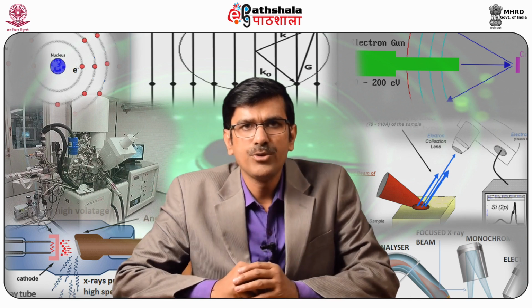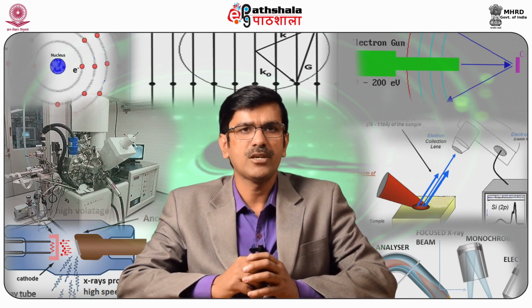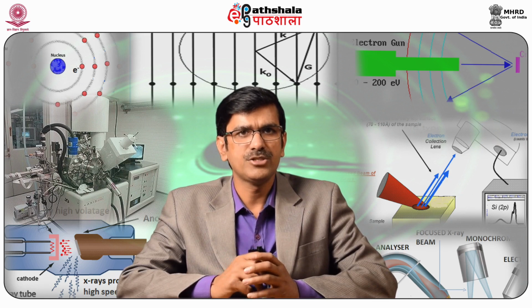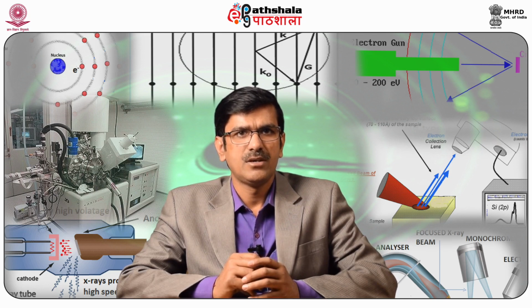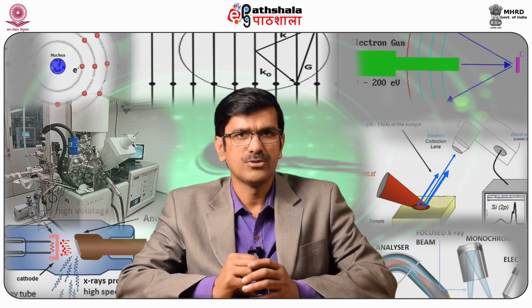X-ray photoelectron spectroscopy, or XPS, is a surface analytical technique which is used to investigate the chemical composition of sample surfaces. It provides wide information about the chemical structure of the catalyst composition. You can even find dispersion also, in terms of the bond or energy which is required, the kinetic energy of the electron. It measures that and relates it to the binding energy of the electrons, which are the core electrons.